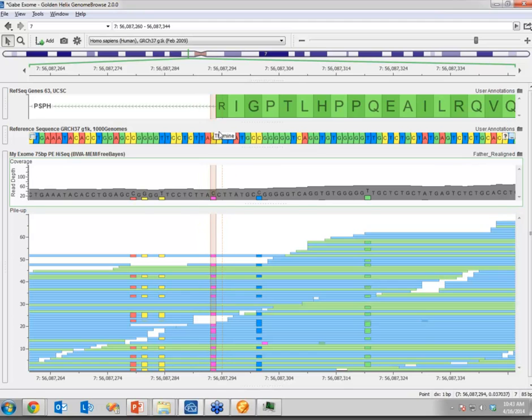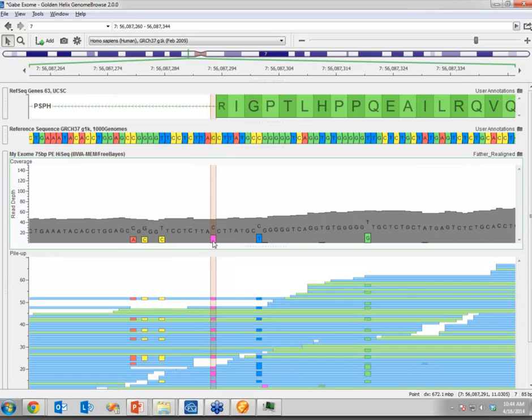Okay, so this is the site that I found was interesting. The reason being, I'm right here on the tail end of an exon and going into an intron gap, and I have a clear 1 base deletion in what looks like probably half of the reads supporting my coverage here. So the variant caller said that I have a heterozygous deletion, and given that this is a functionally significant gene, that's interesting. Thankfully, it's not a homozygous deletion. It would have clinical implications.